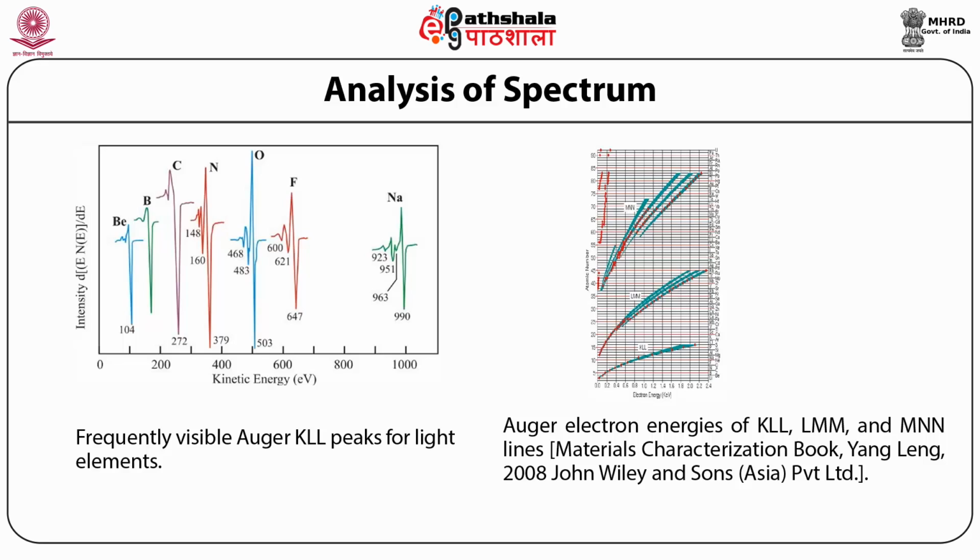The direct mode spectrum expresses the energy distribution as the number of electrons times its kinetic energy, which is E N(E). The differential mode spectrum is represented by E times dN(E)/dE as the axis parameter.